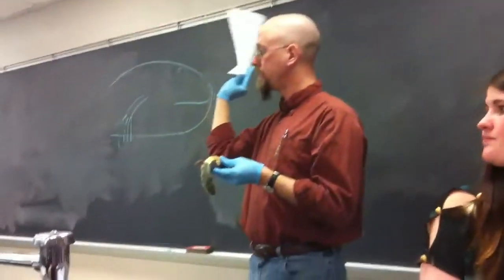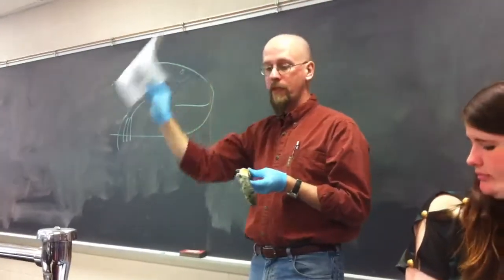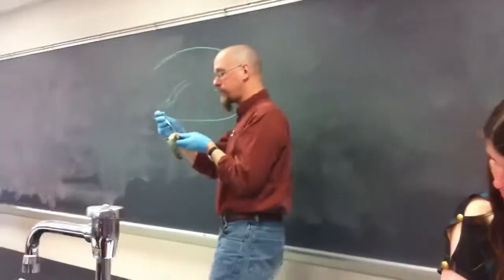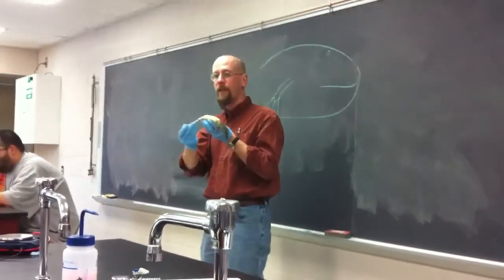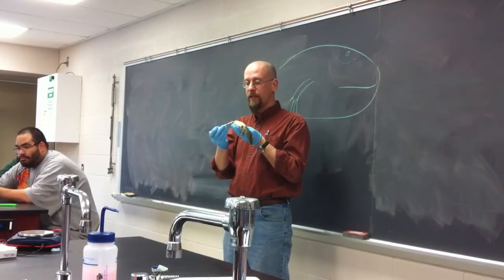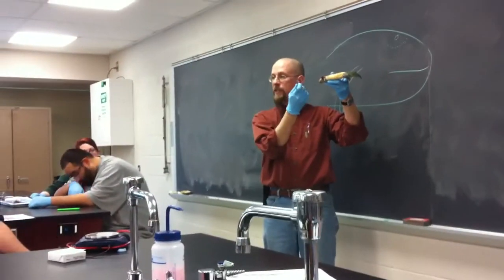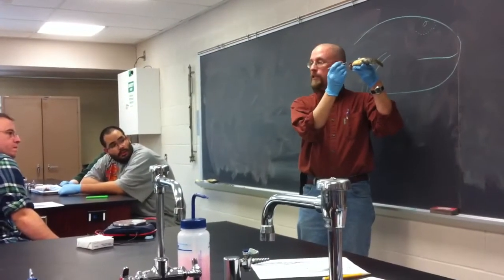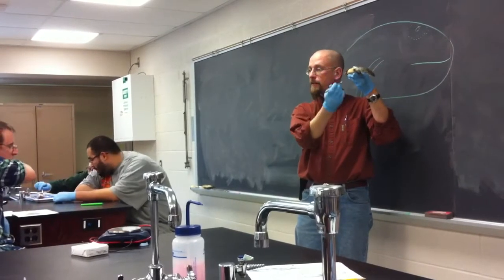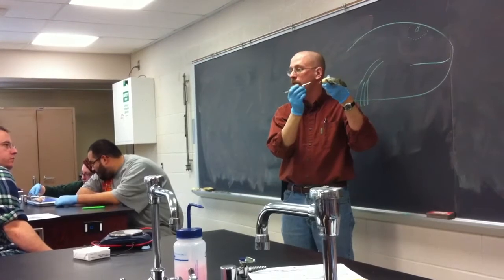It's this one here, where if you look at the top illustration, what they're showing you is a cutaway for progressively deep layers of the oblique muscles. The external obliques are the ones on the surface. If you look at your Mudpuppy, look at the orientation, so mine's facing me. The external obliques, the fibers of those muscles go from top to down to the back, right? And you can see that on that diagram. The orientation of the fibers matters.